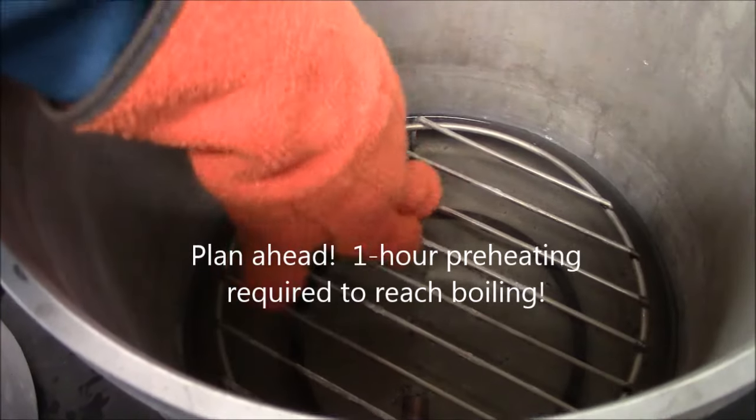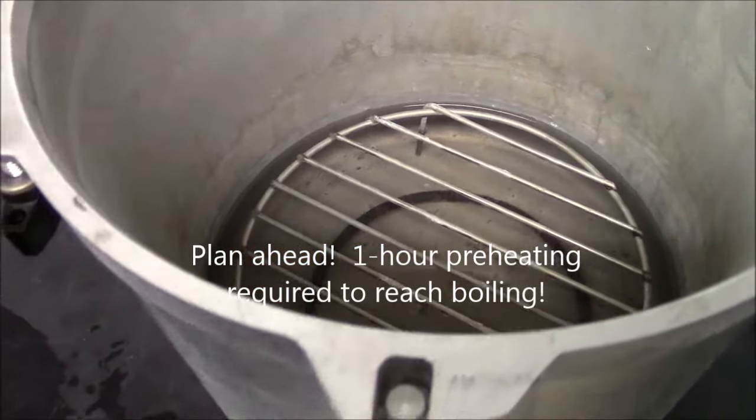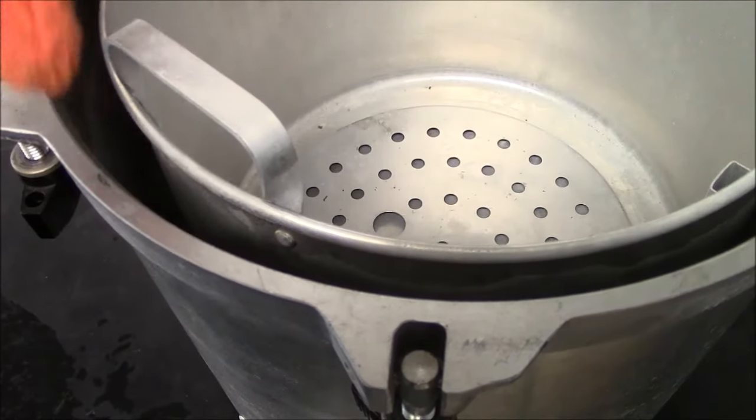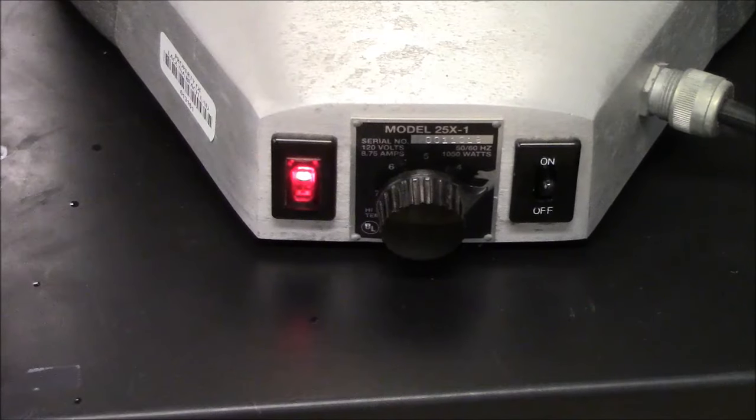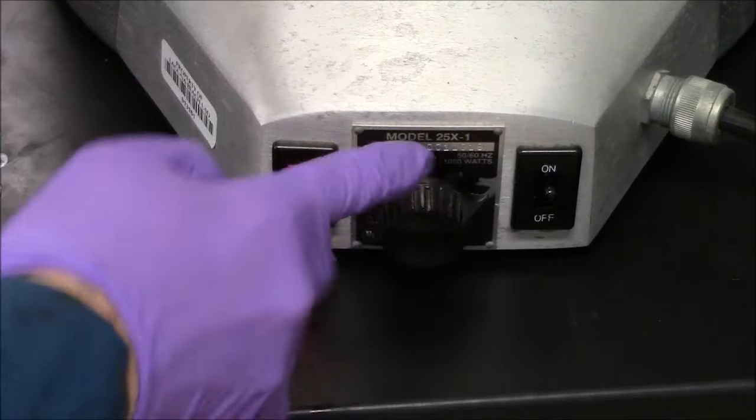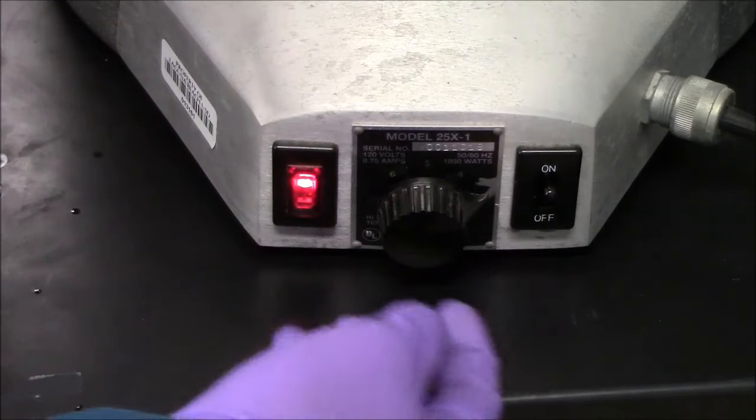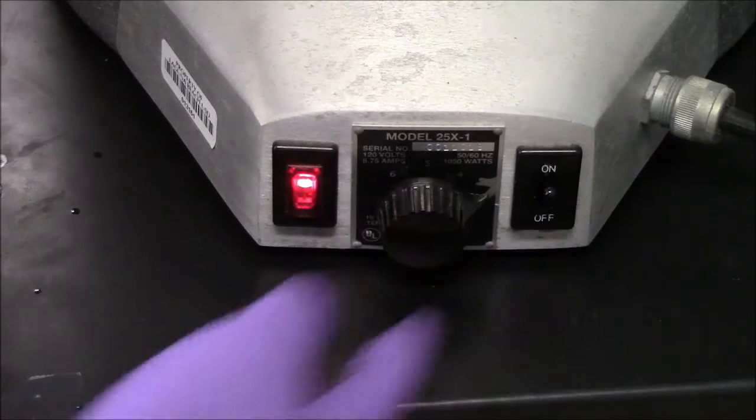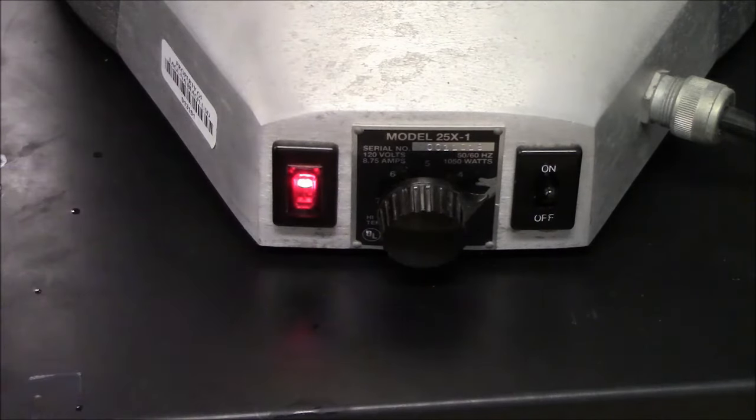You'll notice there's a platform here on which the actual container will rest. Here are the controls. This is the power knob. I've made a little notch here on the side showing you this is where the dial should be. This on off switch tells you when the heating element is actually heating.